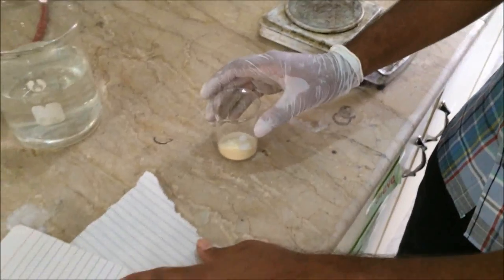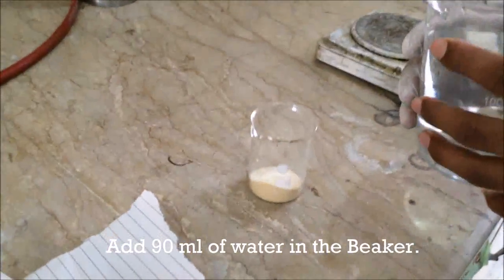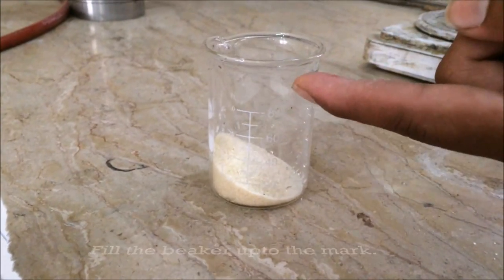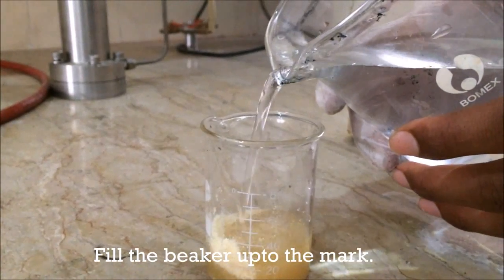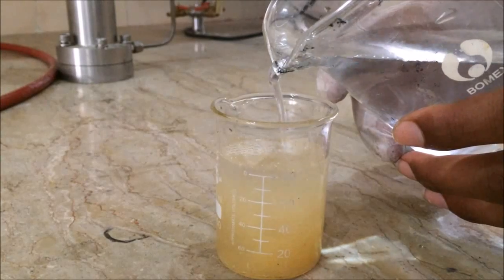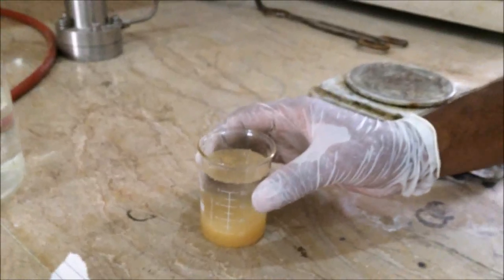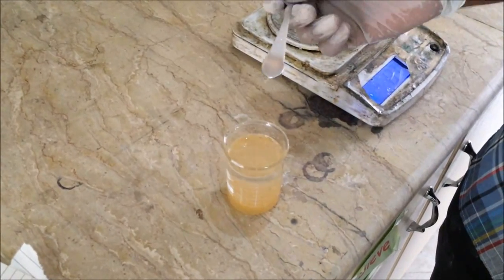Now we have to add distilled water up to the 100 milliliter mark, preparing a solution of approximately 90 milliliters of distilled water and 10 grams of gelatin powder. You can see the marks on the beaker. Our solution is now almost ready, containing 90 milliliters of distilled water and 10 grams of gelatin.